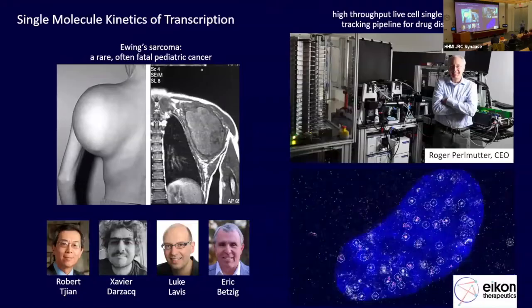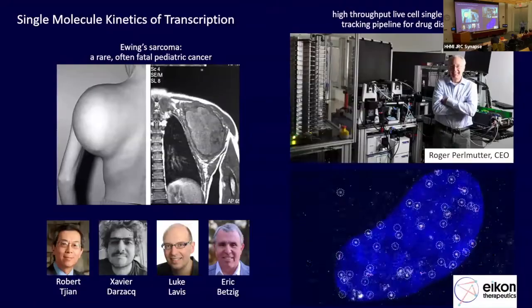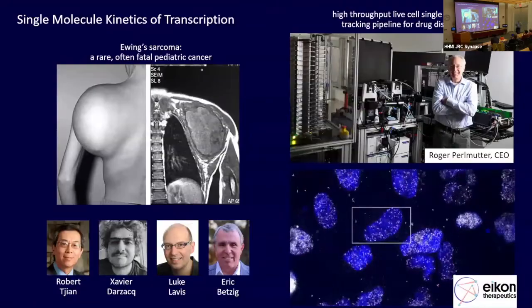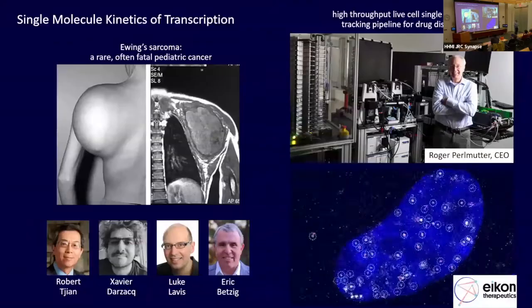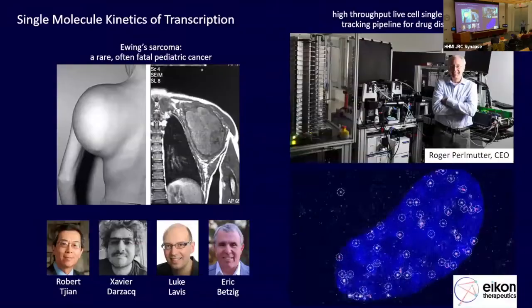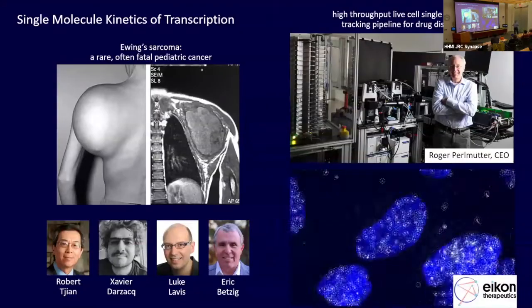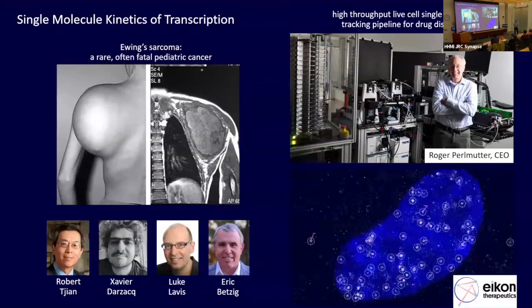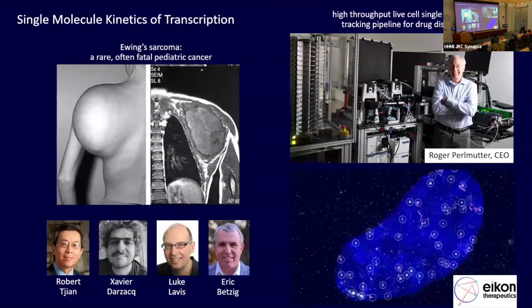And it is just jaw-dropping. You can't see, it's behind the wall still. But it's absolutely jaw-dropping what they have discovered about protein-protein interactions in cells by single molecule tracking. They know so much more about protein interaction networks than anybody on Earth at this point. And they're actually quite far along in the development of several compounds that may lead to actual therapeutic results that come out of this.